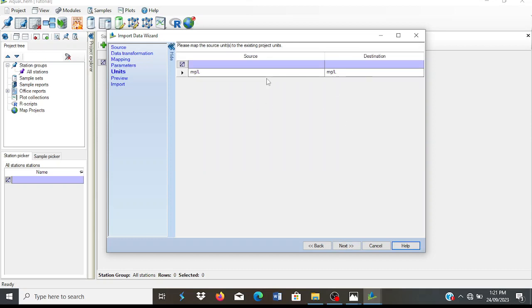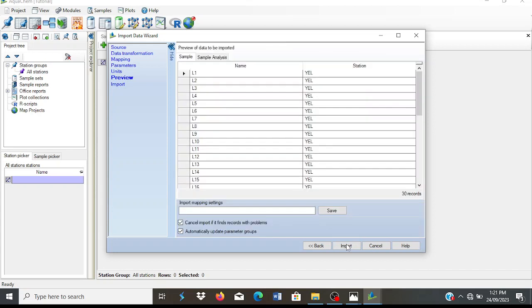Oh, I have just one unit. This, I didn't have another unit there in my table. pH doesn't have a unit, but I have put milligram per liter for it. That's wrong. I'm sorry. So next, move to this. I've just been clicking next. You know that. Then the final one is you could check around this.